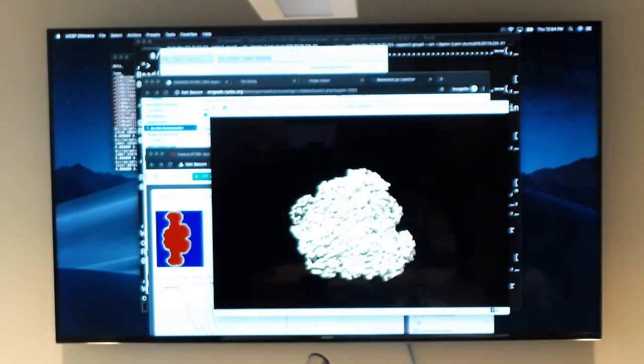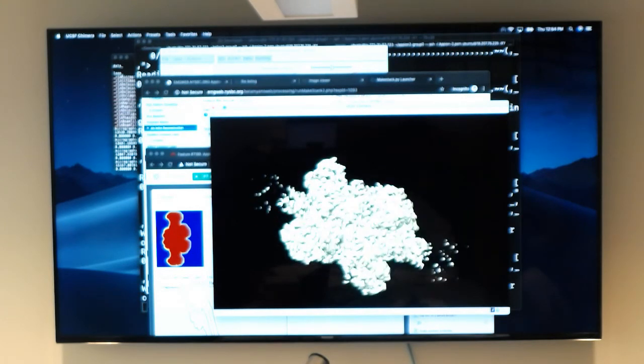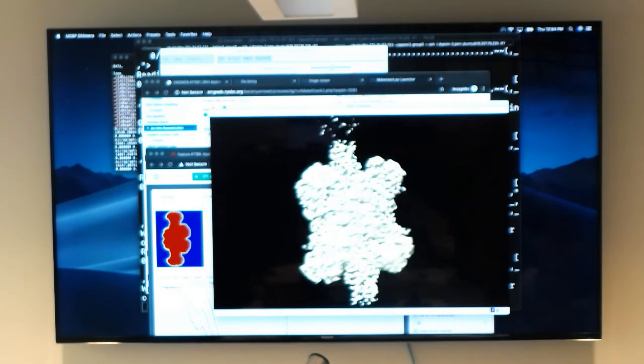And so that's why no modality stands alone; structural biology can be used in concert, in a complementary way. So you can make use of all the different modalities and combine them. But you can see, even after a couple of iterations, quite a bit of detail.